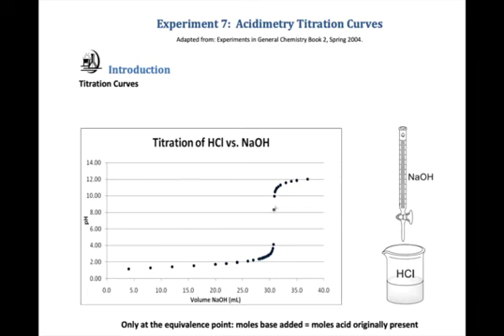When we get close to the endpoint, the pH will likely be higher than pH 7 at the equivalence point, but it'll have a steep place, and we can find a volume that it takes for a complete reaction, even for a weak acid. So that reviews the concepts that are going on with this experiment.